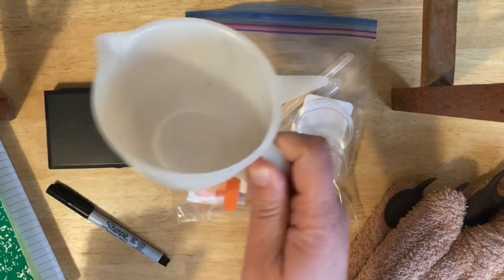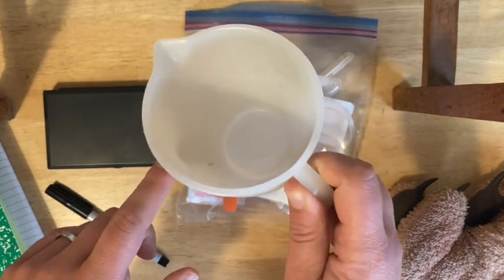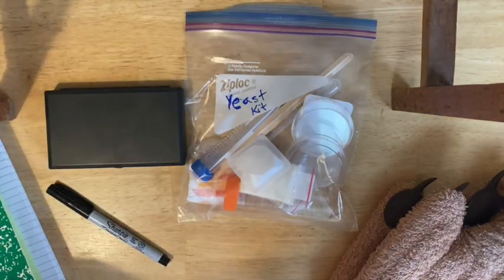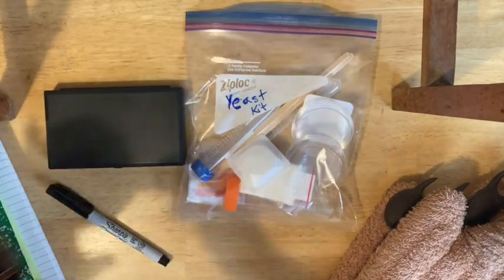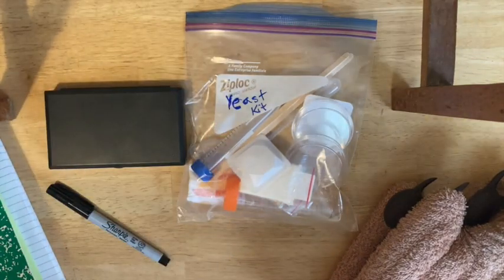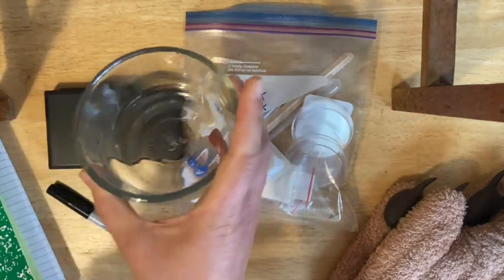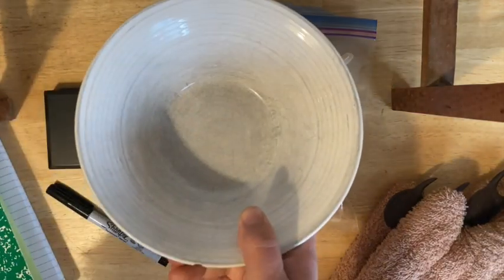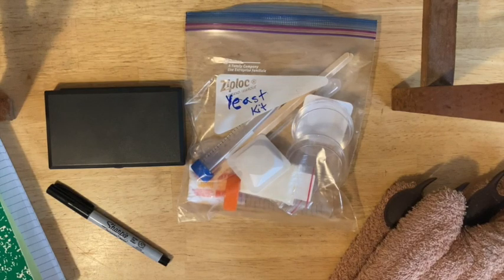Ideally use something with a pour spout, like a glass or plastic measuring cup that's microwave-safe. Really, anything that's heat-proof and microwave-safe will work — a microwave-safe mug, a mason jar, a Pyrex Tupperware, or even a regular bowl — just something that can hold a small volume and go into the microwave safely.